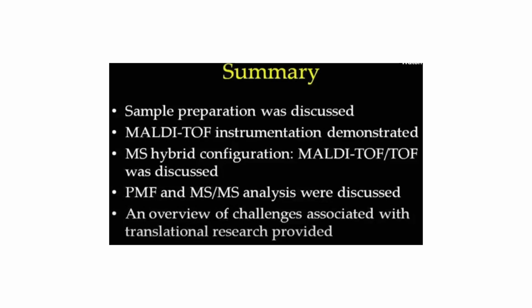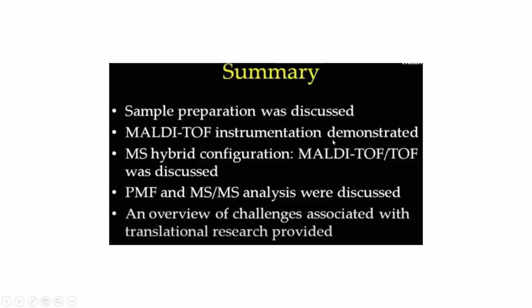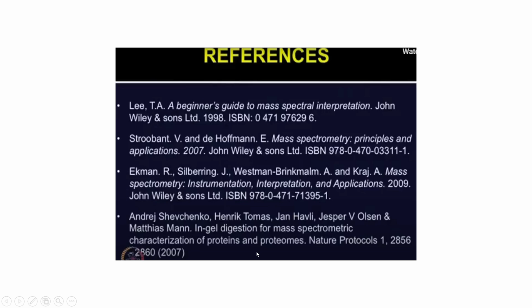But still, we initially discussed n number of benefits of using DIGE technique and MALDI-TOF, but for applying it towards the bedside, these are certain challenges basically. So in the whole lecture, sample preparation was discussed, how MALDI-TOF is performed, how TOF can be added for making it more accurate, MS/MS analysis, and an overview of challenges associated with it. These are certain references which sir has provided. You all can go through these books which will help you understand in a much deeper way how mass spec is performed.